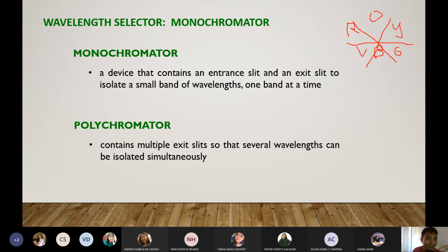Okay. So, hopefully nakwento na sa inyo ng prof niya, no? Paano mo malalaman kung anong wavelength gagamitin mo? Basically, you check kung ano yung complementary color, no? Kunwari, kulay red yung object mo. Ibig sabihin, ang wavelength na gagamitin mo is green, no? Okay? Kasi yun yung ina-absorb niya. For absorption to, ha? Okay.